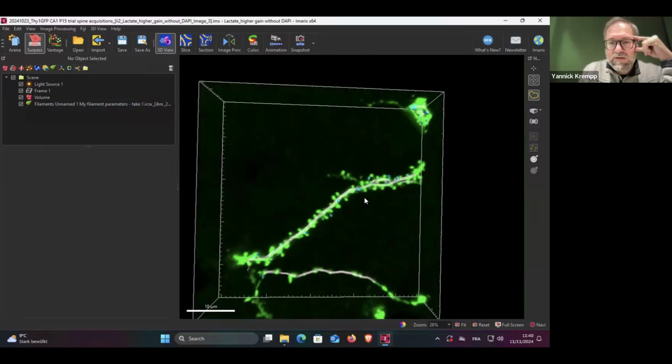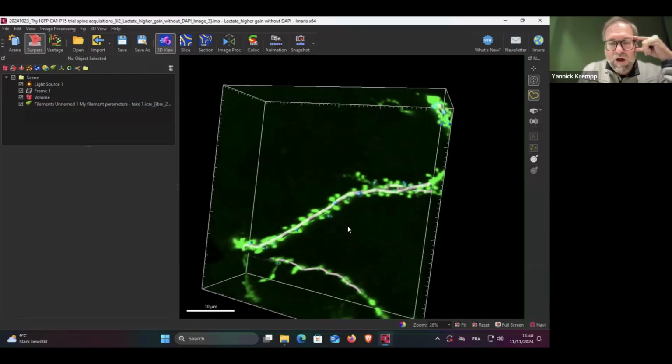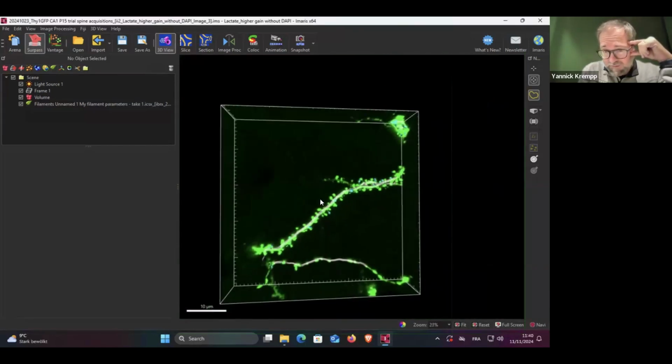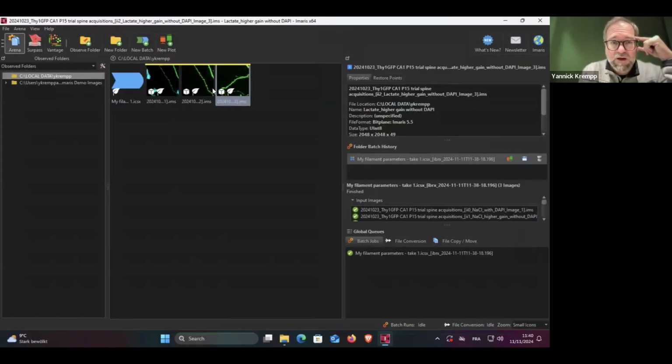So in this case, I think that the creation parameters I've used are not versatile enough. In order to make them versatile, so that you can apply them to all types of files, you really have to be careful with what you choose.